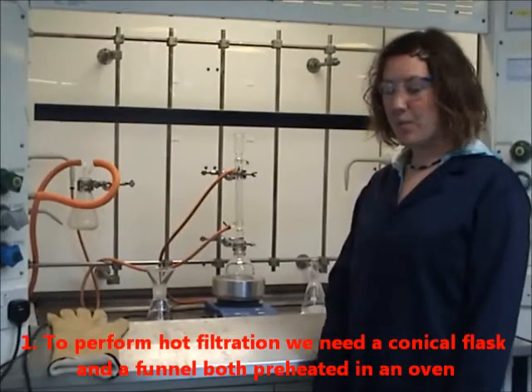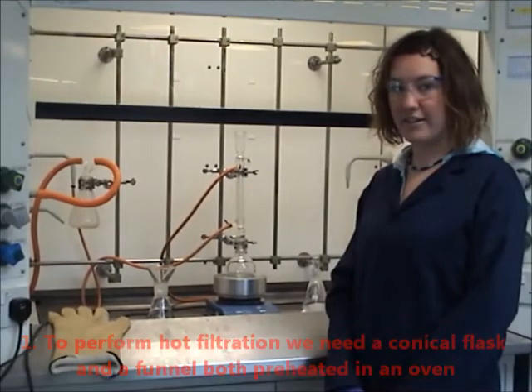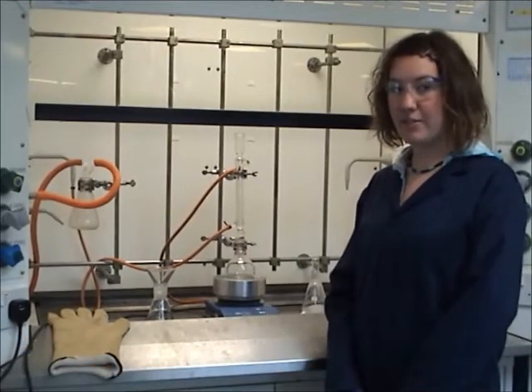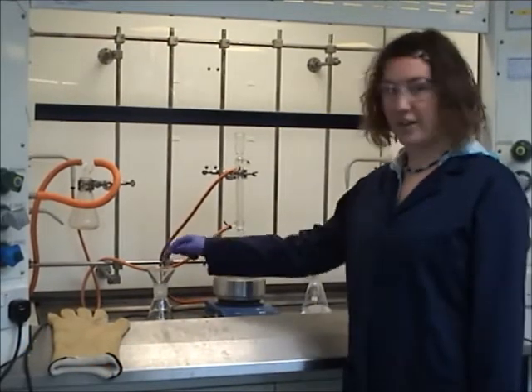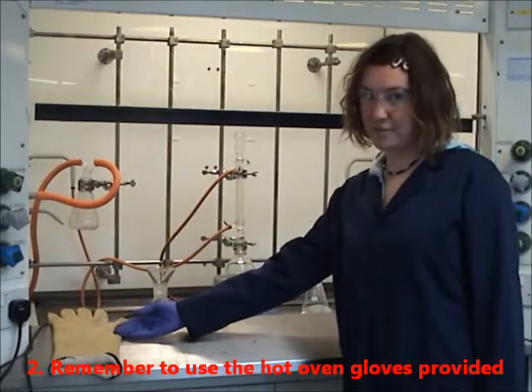To perform a hot filtration, we need a conical flask and a funnel, both preheated in an oven. This is to reduce the amount of crystallization occurring on the funnel. Remember to use the hot oven gloves provided.